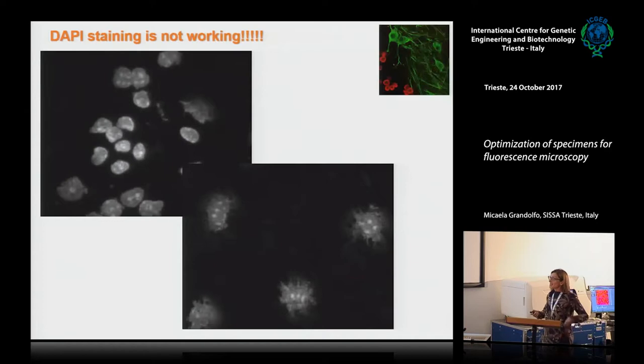So I asked him, but probably there is something wrong in your fixation. Maybe, I don't know. And he said, no, I use exactly the same solution, exactly for the same time, this is not the problem. Okay, to make a long story short, the problem was that these cells were fixed for 5 minutes at room temperature, and this for 5 minutes at 4 degrees.